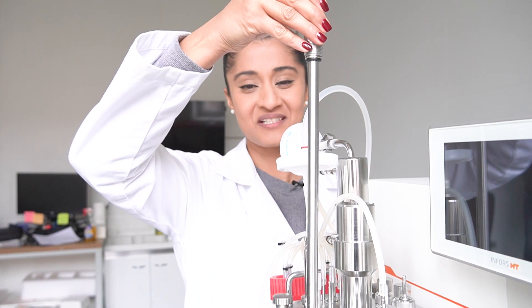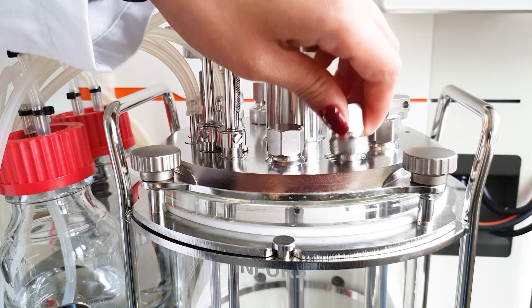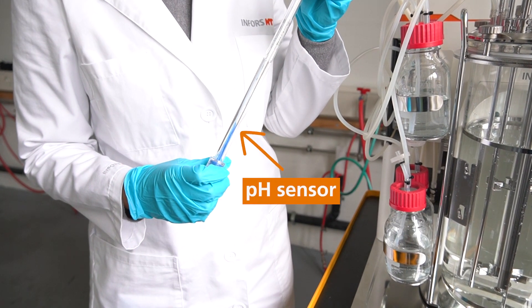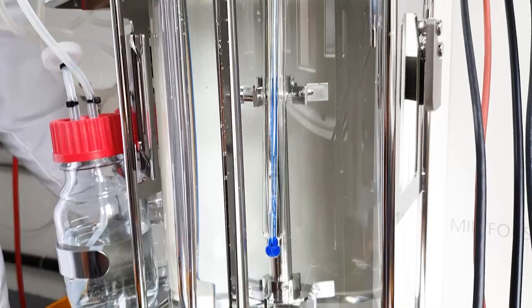This is the dissolved oxygen sensor. Please do not forget to place an o-ring when installing the sensors.